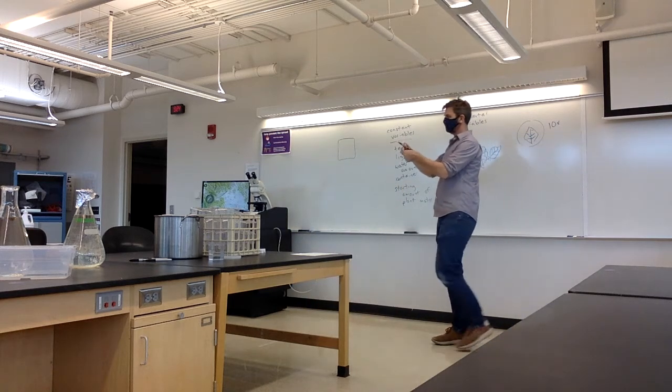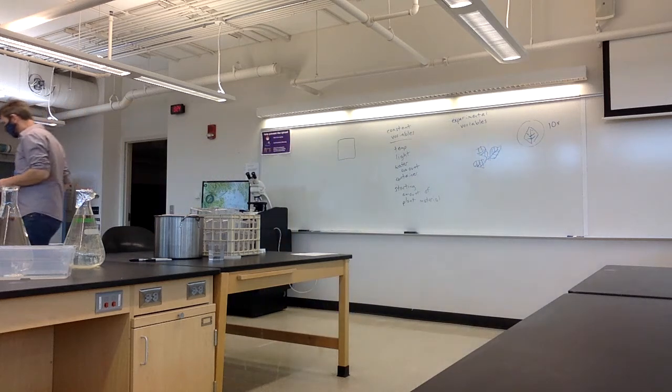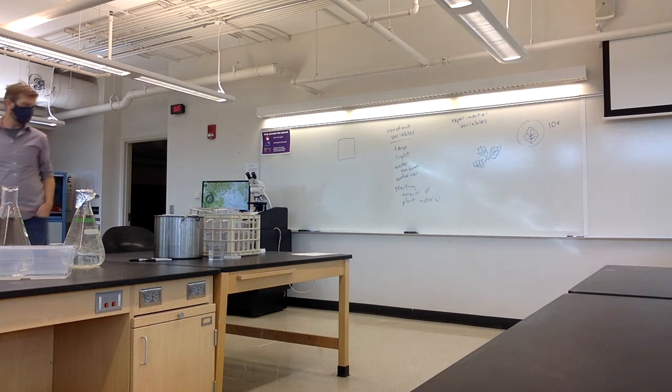I think they might come apart easily if you kind of agitate them. I'm not sure. You can shoot for pieces of the same size. Something like that, maybe. Let's see. I think that's a little more standard starting point. I don't know what it looks like to put 10 of those in. That might be a lot.